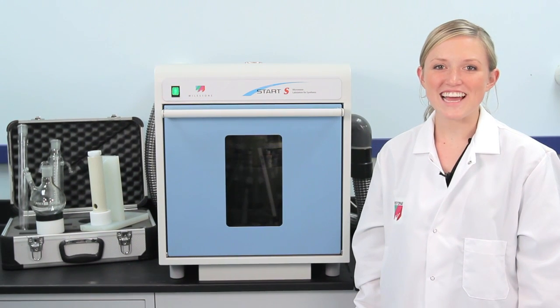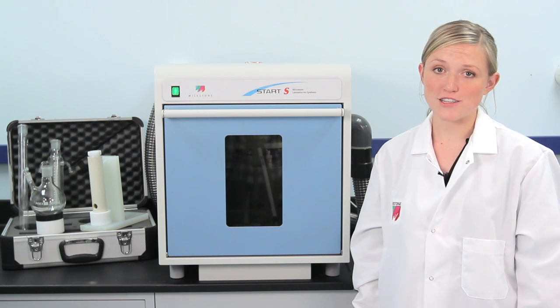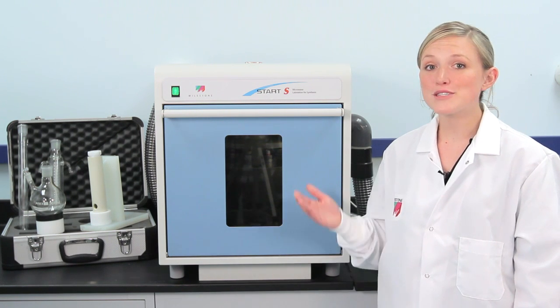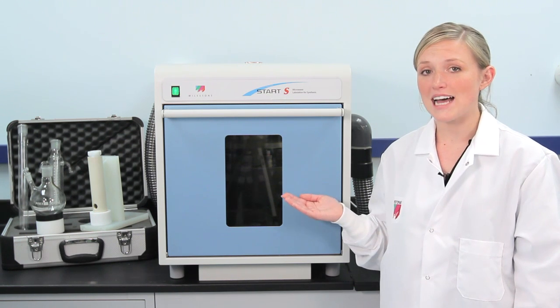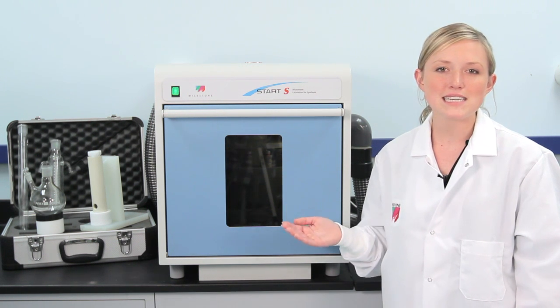Hi, I'm Melissa Leitner with Milestone. Microwave-assisted synthesis has become a mainstream technology for teaching in undergraduate classrooms. Milestone Start, the first microwave used in academia, has been purposely designed for teaching microwave synthesis and is the easiest and most flexible system on the market, all at a great price.